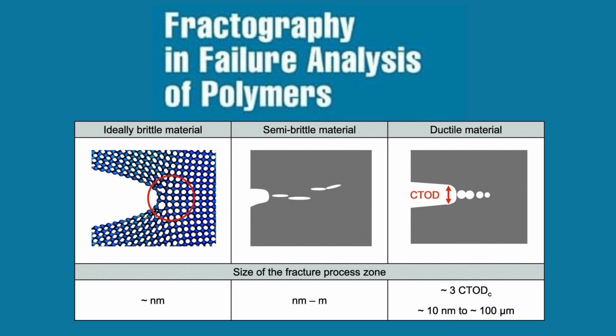Fracture analysis of plastics uses fractography, examining fracture surfaces with optical and scanning electron microscopes to determine how and why a part failed, identifying mechanisms like ductile (tearing, deformed) versus brittle (sudden, flat) failure, fatigue, creep, or environmental stress cracking.